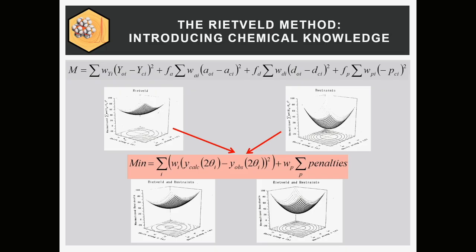So you want that the chi-squared surface, which is very shallow, meaning many solutions look right. There's only one correct one, but the system from the powder pattern cannot distinguish if the carbon atoms are here. But it could do this when it knows it's a rigid body. Then the rigid body will be more or less fixed here.